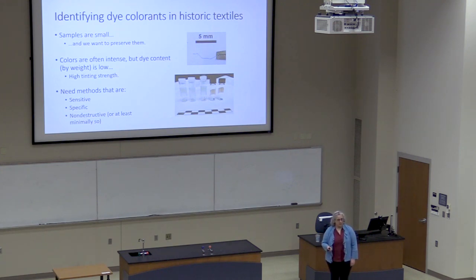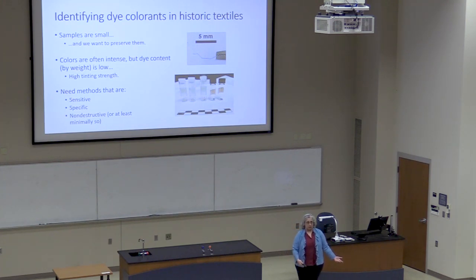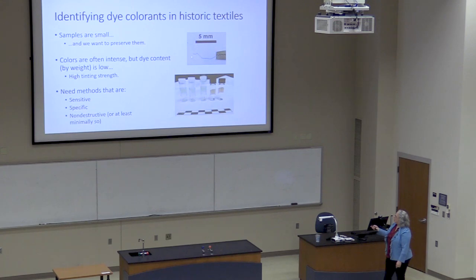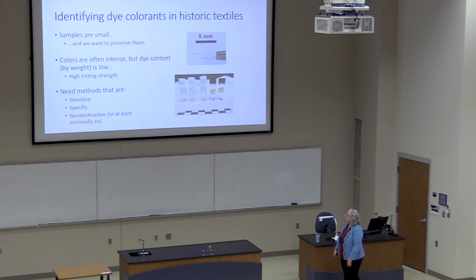Kind of seems to work that way on TV, though, right? Like CSI, we get a thing, we put it in the box, the thing tells us the answer after it goes ding, right? That's not really how science works, except I'm going to show you one that almost works that way. It's cool, so be looking forward to that. So this is kind of like, if they had their choice, that's all they'd give me. So this is the end of our tweezers. This is one fiber. Not a yarn spun together. This is one fiber. Okay, and well, they kind of like us to give it back when we're done.